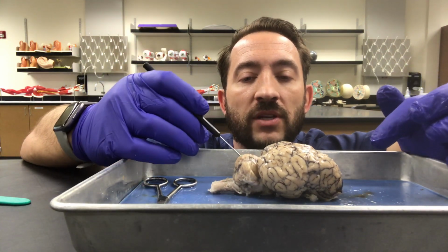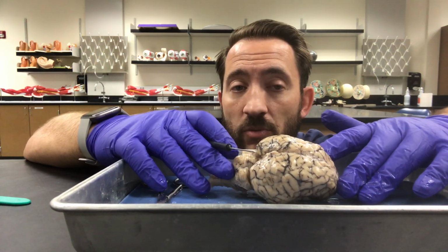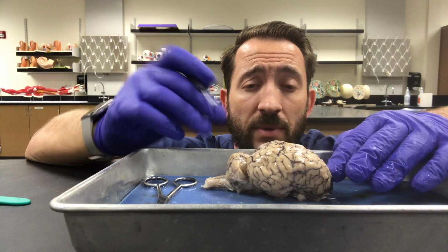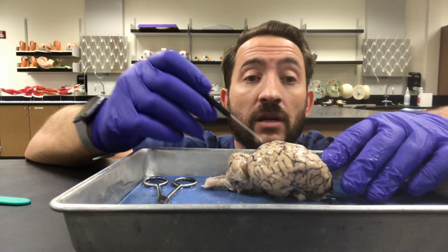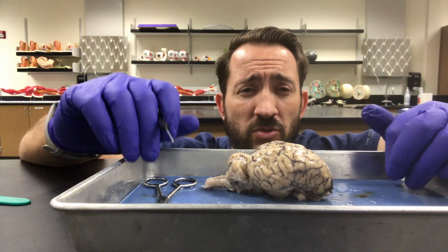So what we're going to do in this video is go over some of the parts of the sheep brain, and this is a sheep brain that I want you to be aware of. So I'm going to show you everything on the outside. We'll cut through. Very boring dissection. Sorry about that. Then after we cut through it, we'll identify some of the structures on the inside as well. So sorry, you're going to be looking at my belly most of the time.